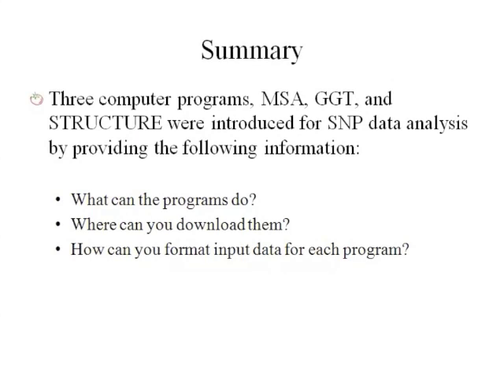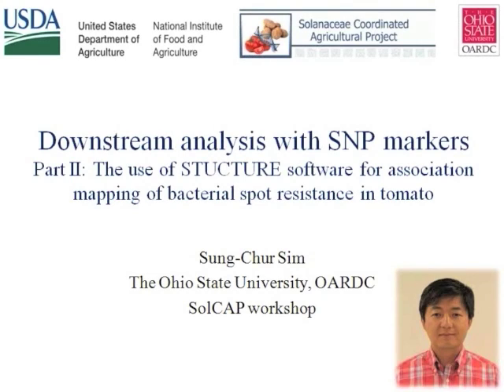In the first part of the presentation, we learned the power of genetic analysis with SNP data generated by the SolCAP project, and also what you can do with the programs, where you can download them, and how to format the input data for each program. In the second part of my presentation, I will talk about the Structure program in more detail, especially its use for association mapping of bacteria spot resistance in tomato.